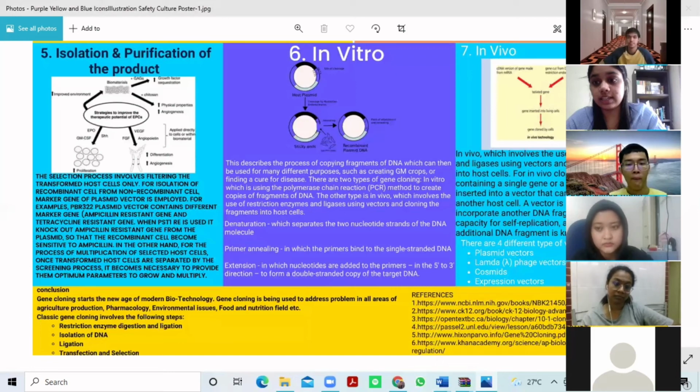Often a plasmid and a gene-sized piece of DNA will anneal together, forming a recombinant plasmid known as recombinant DNA. Fourthly, the recombinant plasmids are transferred into bacteria using electroporation or a heat shock. The last step is that the bacteria are plated and allowed to grow into clones, and all the clones are called a gene library. The gene library is screened to identify the clone containing the gene of interest by looking for the DNA sequence or a similar gene.